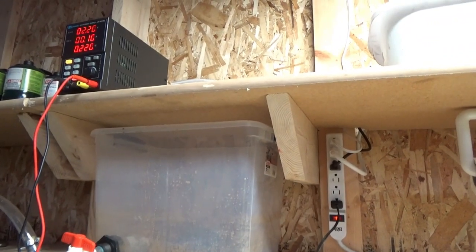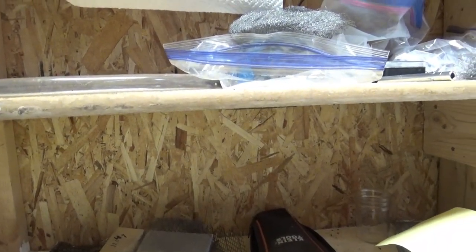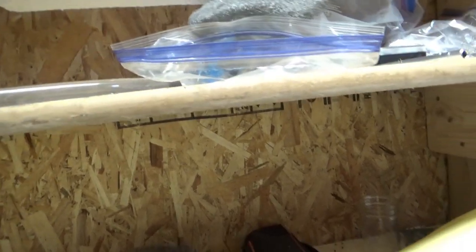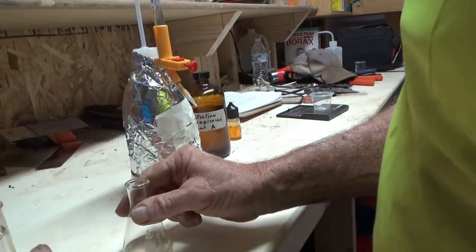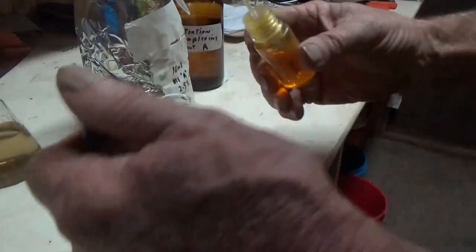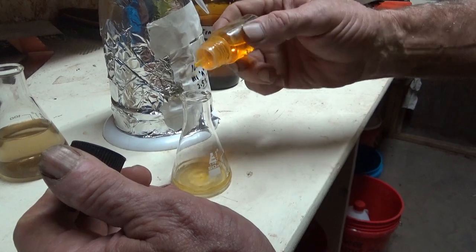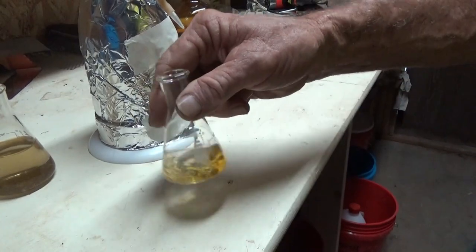The number went up again, Bear. Okay. And that would be 1%. That shows more like a 10%. Yeah. That's what my math is saying, too. Okay. Now, maybe what we're dealing with is the Super Eco Gold X, so it may not follow those same instructions in terms of the concentrations. We shall see.